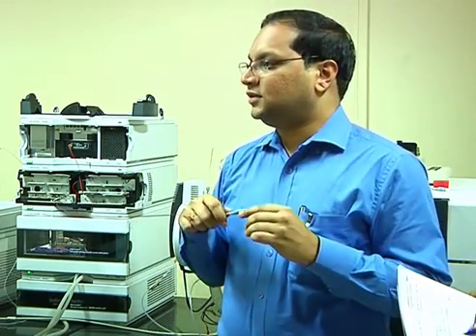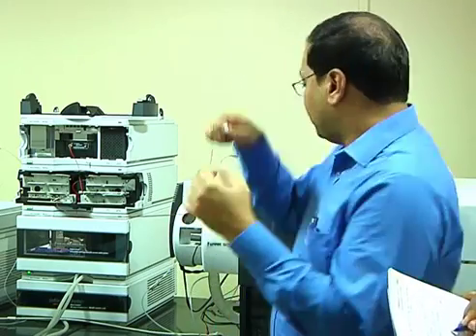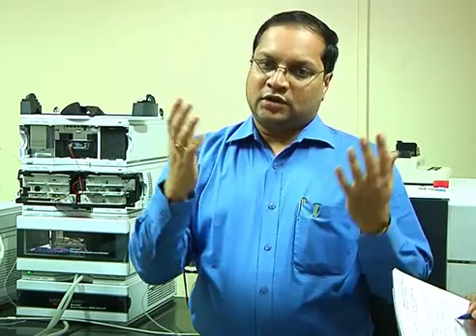Has anyone used HPLC? If you have, what is the readout of an HPLC? If you inject the sample, how do you see the chromatogram? I'll ask you a question: if I give you a chromatogram of an HPLC UV, and there are 6 peaks, what does it mean?